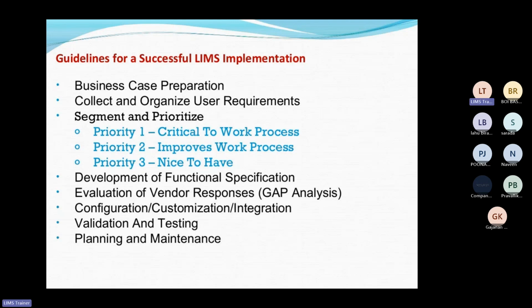As and when he clicks to take the printout from the weighing balance, all the data, including the time and the user, everything will be recorded directly in the software. This is how human error will be zero. There will be no human error. Got my point? That's why all the industries are shifting from manual mode to auto mode. The big industries have already shifted, but for small industries or new laboratories, there is a big scope for LIMS implementation.